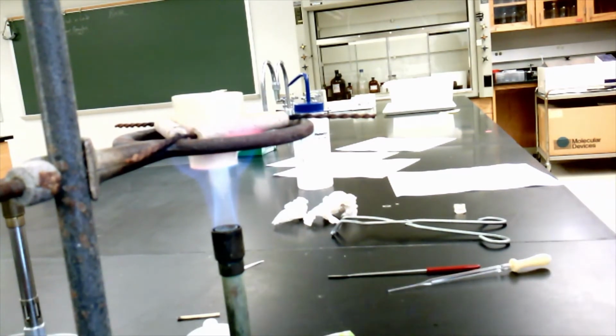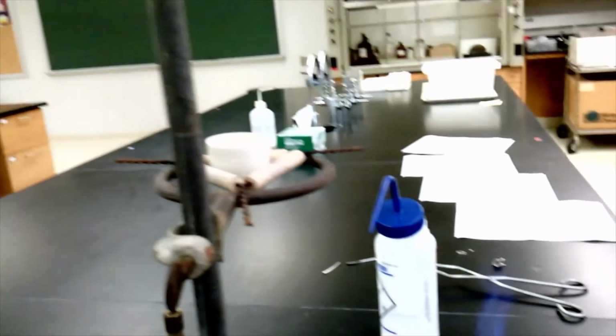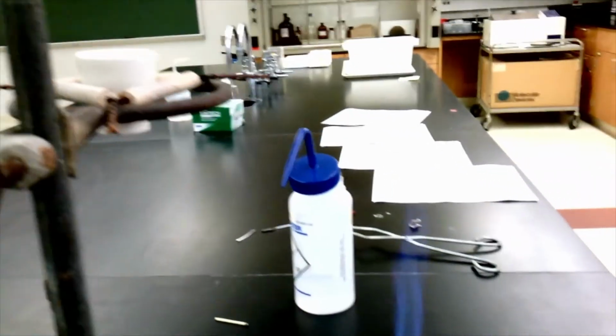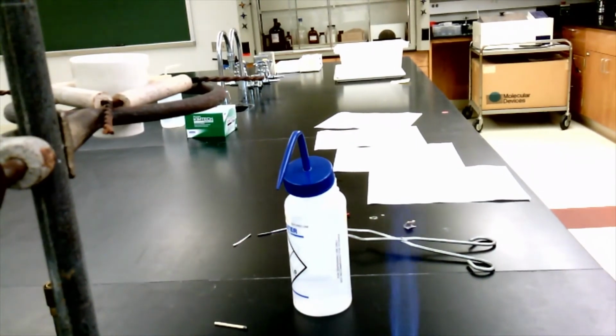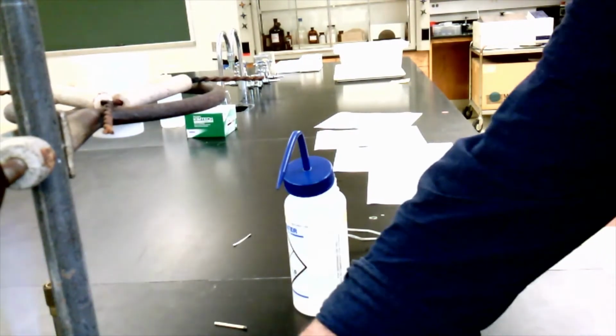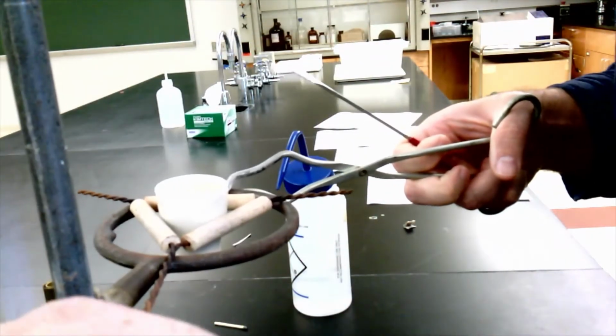Okay, so that's the next step that we're going to do once I let this heat for another minute or two. I'm going to let it cool, and when it's cool, we'll come back and we'll add water to it. Crucible, it's kind of hard to tell from the perspective here. Crucible is up here, and everything is nice and cool inside now, or pretty cool anyway. Remove this, it's not right in my face. And we're ready to add some water to this.